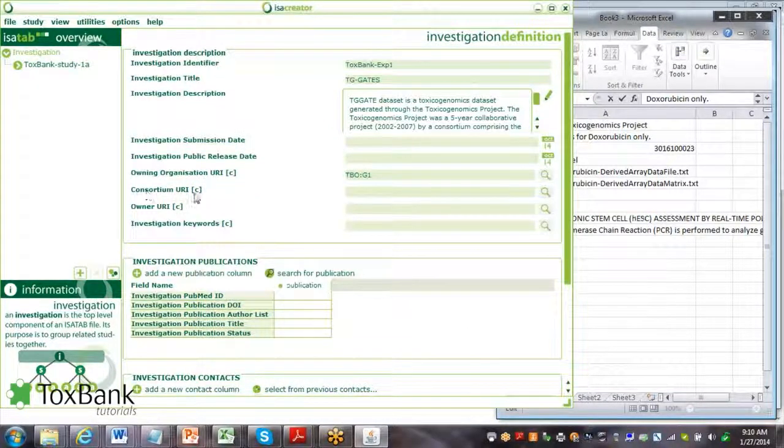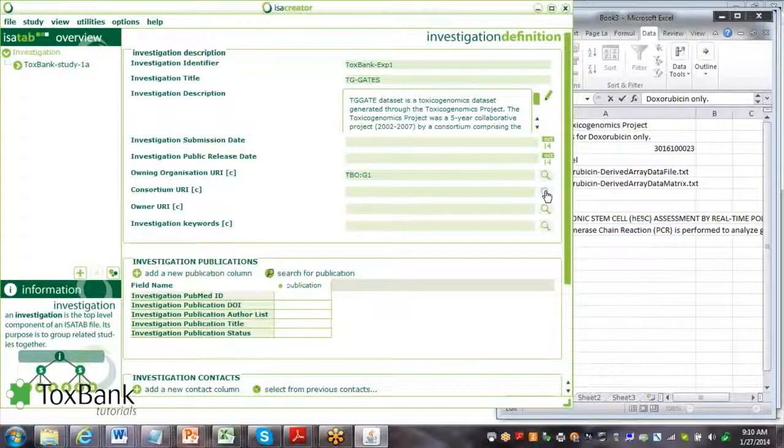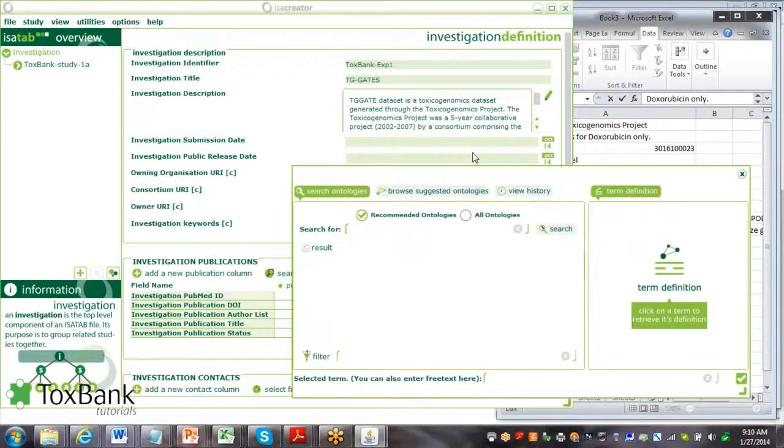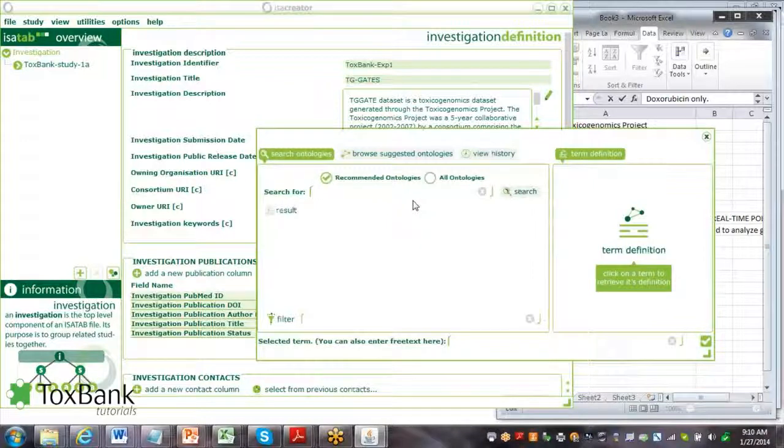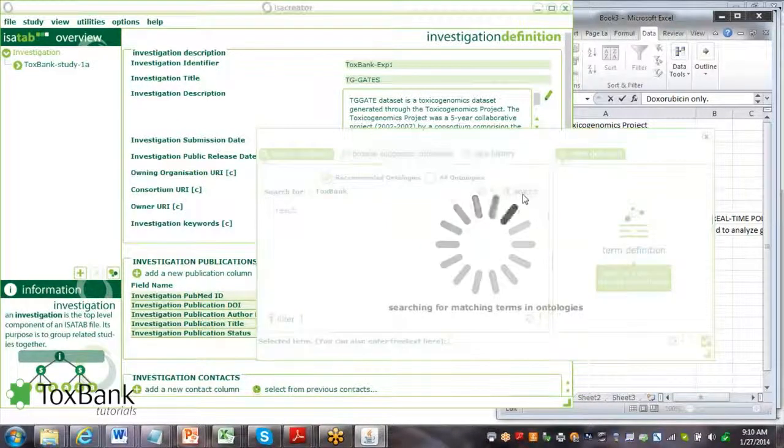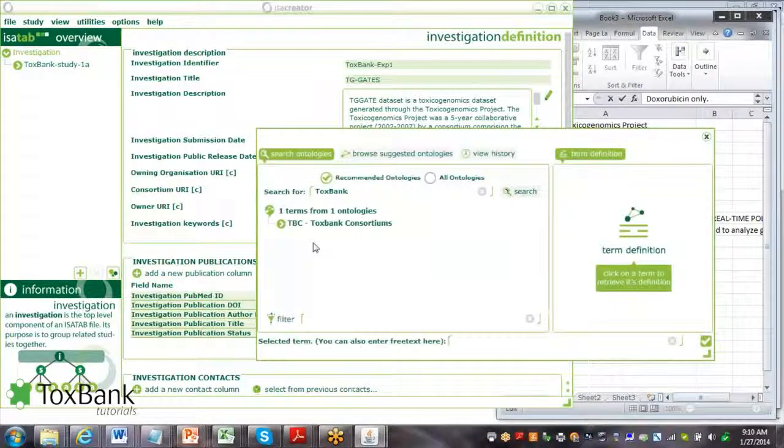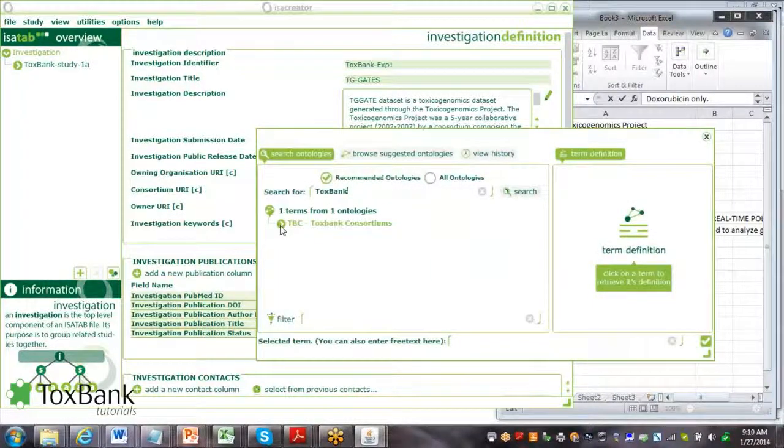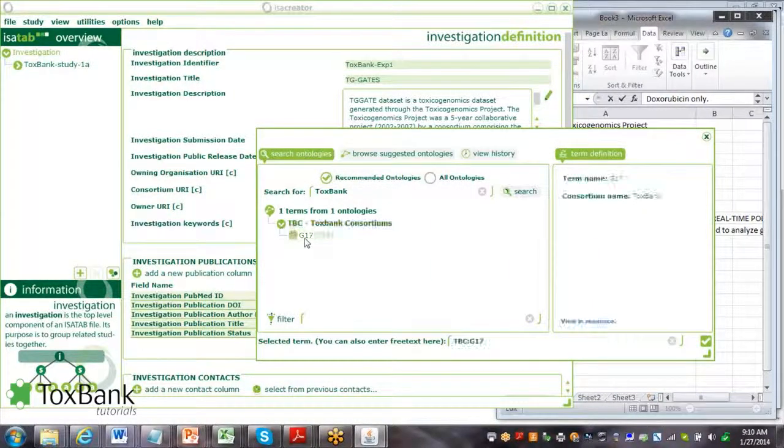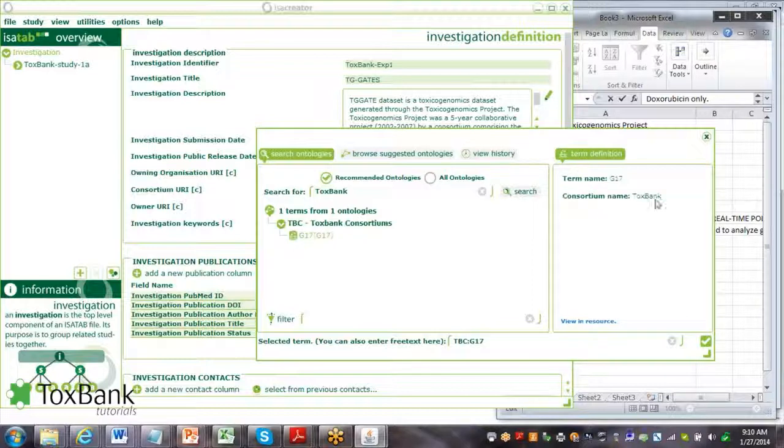The next is which consortium does this investigation belong within? I do a search, and I search for Toxbank. Again click on search. It's going to search the Toxbank warehouse to find the particular consortium here, G17. We can verify that's Toxbank.